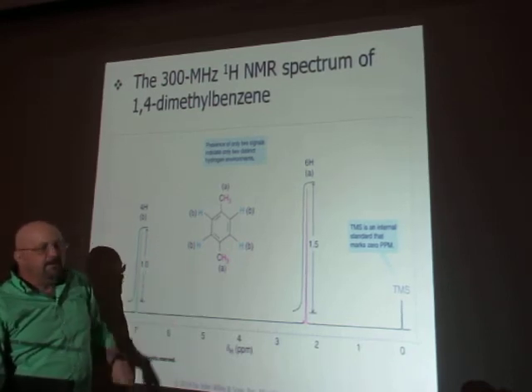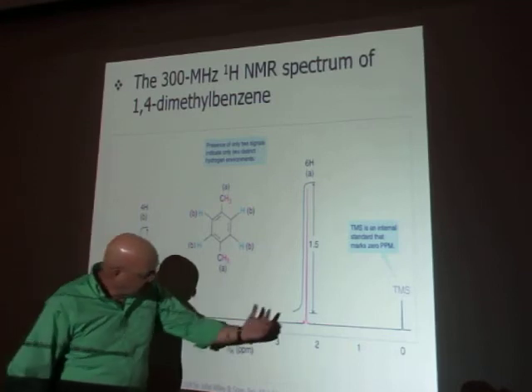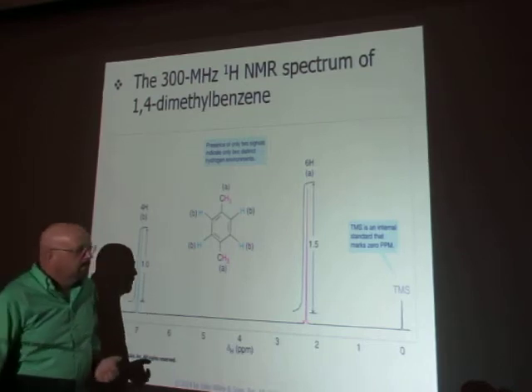So we've got two different kinds of protons. I will have two signals. And you can see that here. I have the signal for the pink ones and I have the signal for the blue ones.